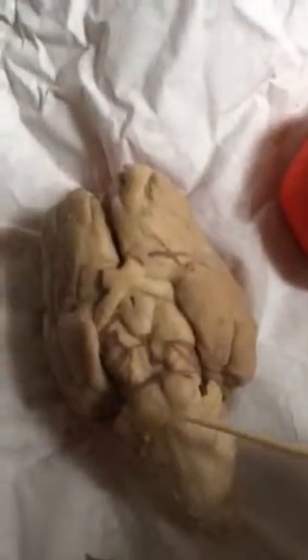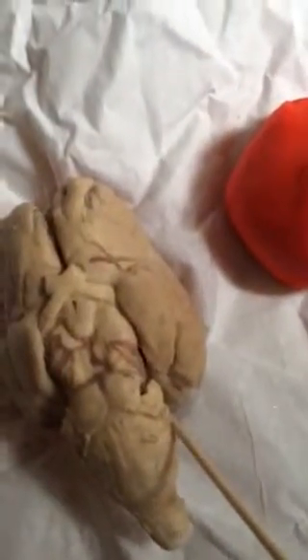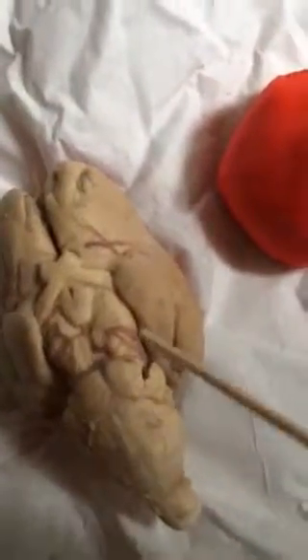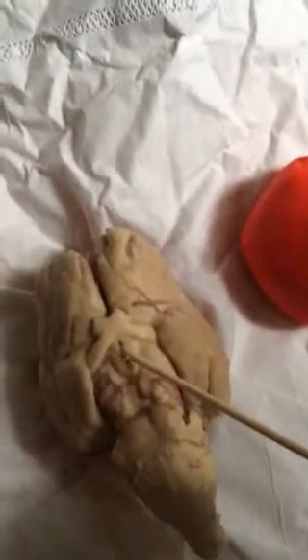On the sheep's brain, the middle peduncle would be here and here, and the inferior peduncle would be somewhere below here. This would be the optic chiasma right here. You can see this is the third ventricle right in here.